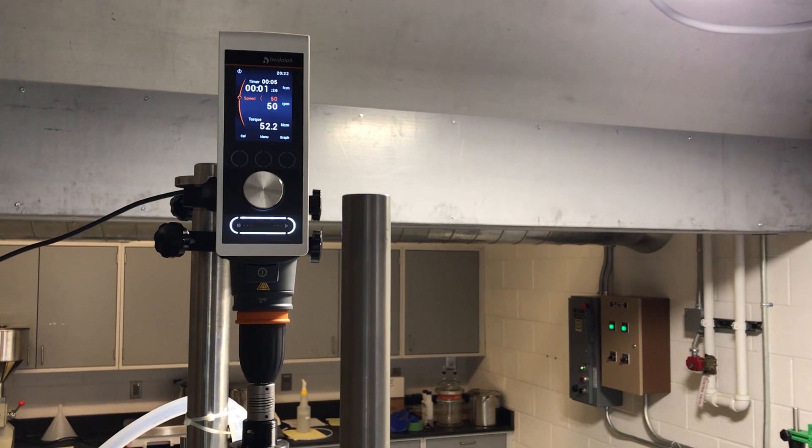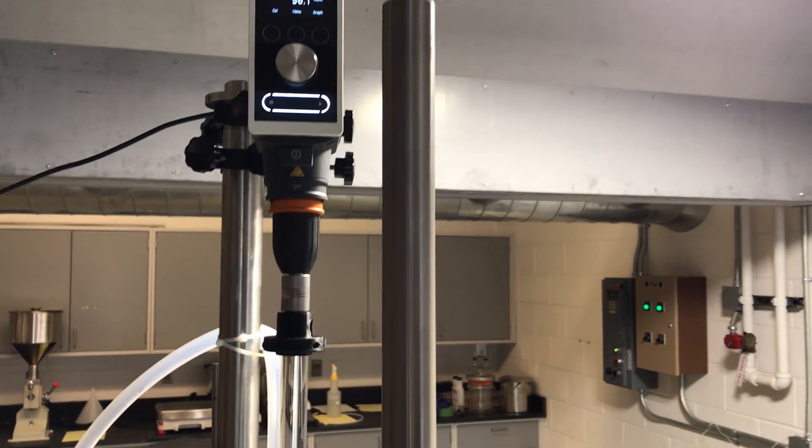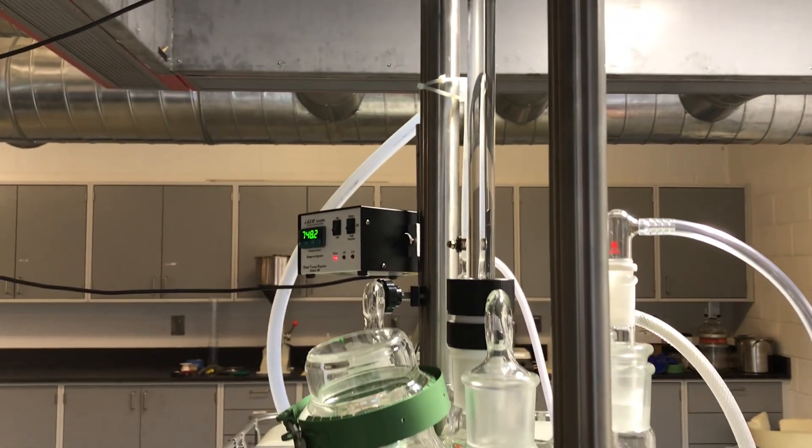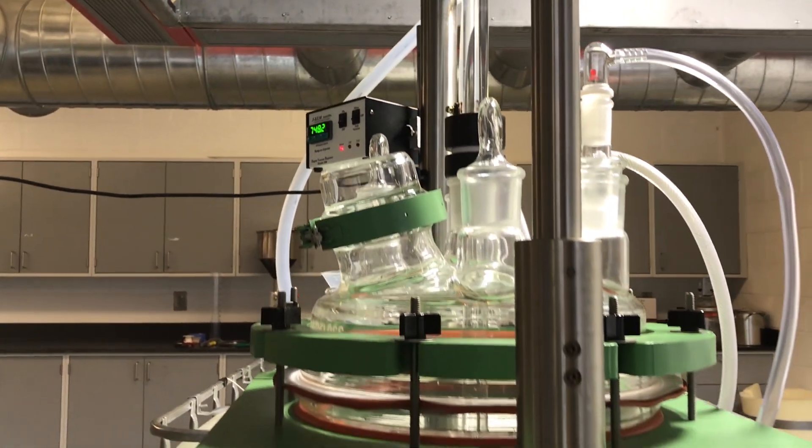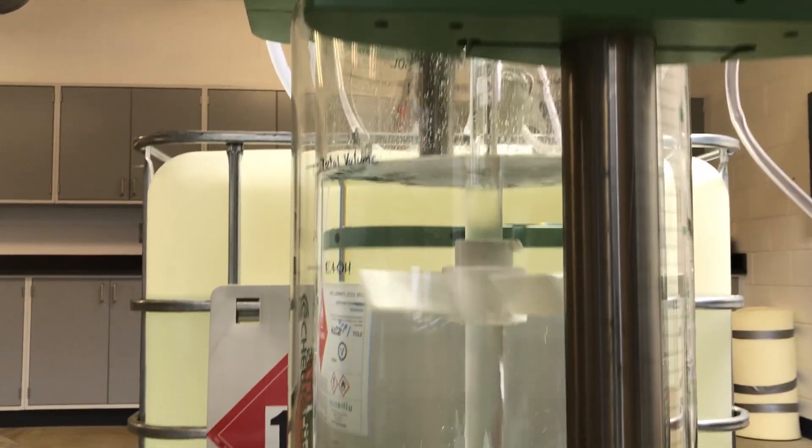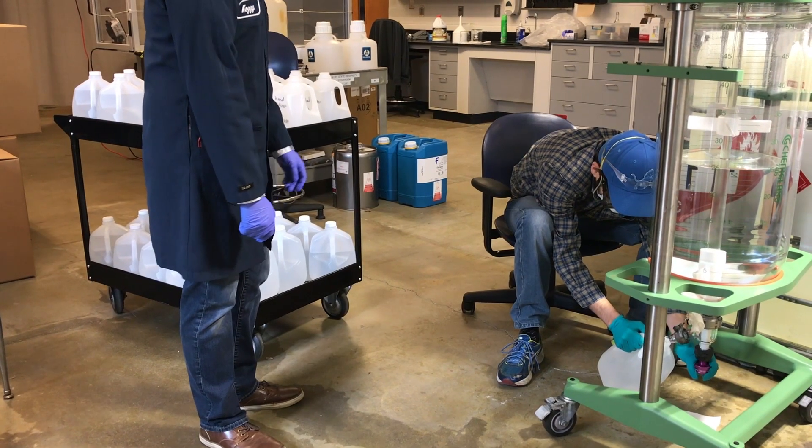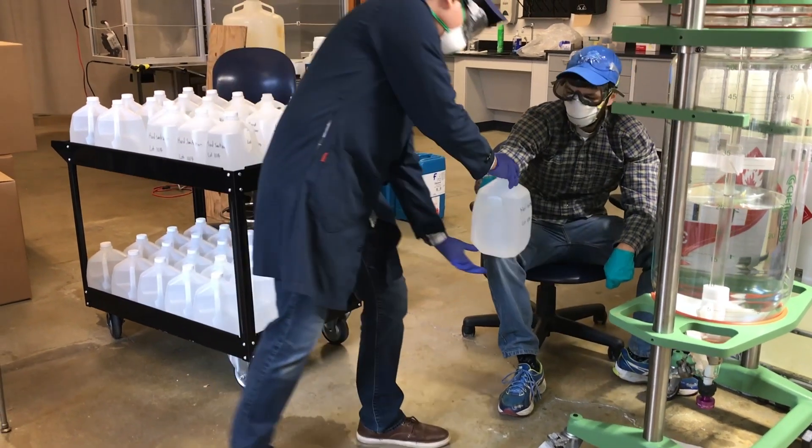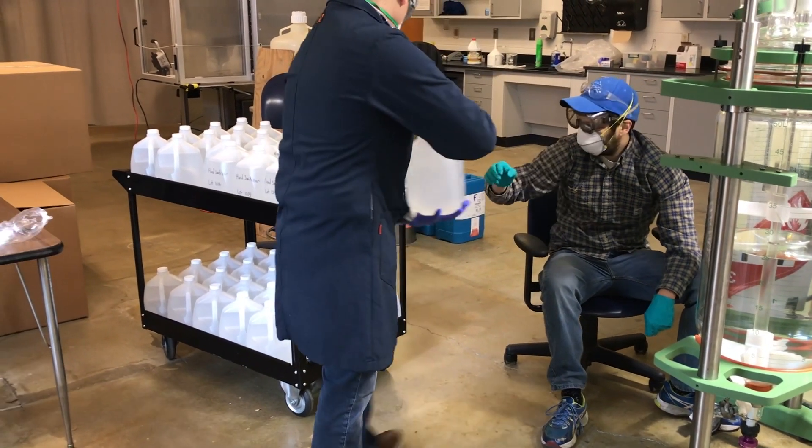The alcohol we're using in this process was donated by Old Town Distillery. The hand sanitizer after bottling is going to first responders, hospitals, and other places in need—not for retail.